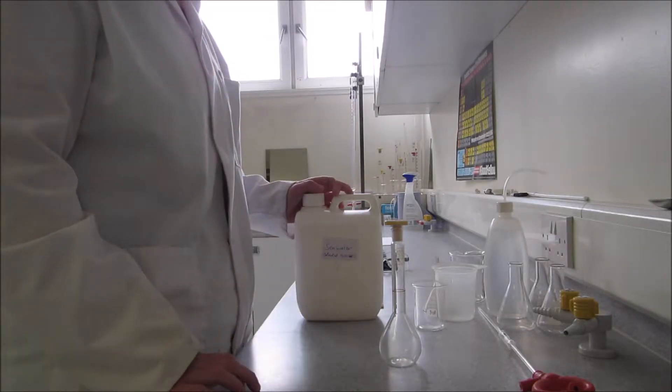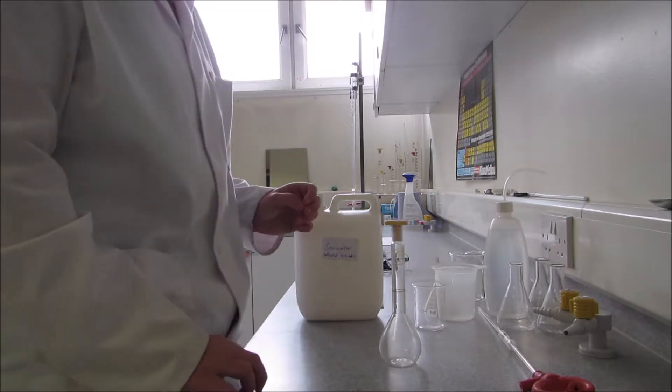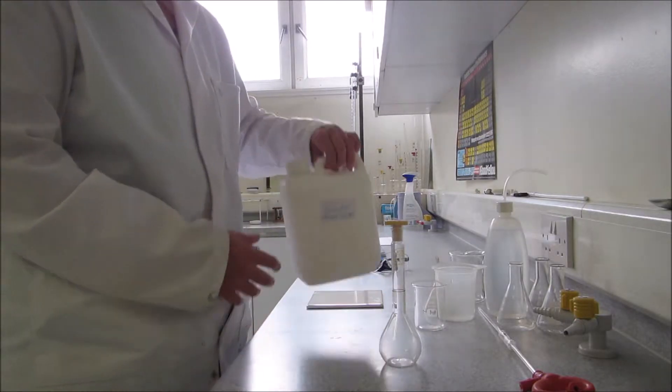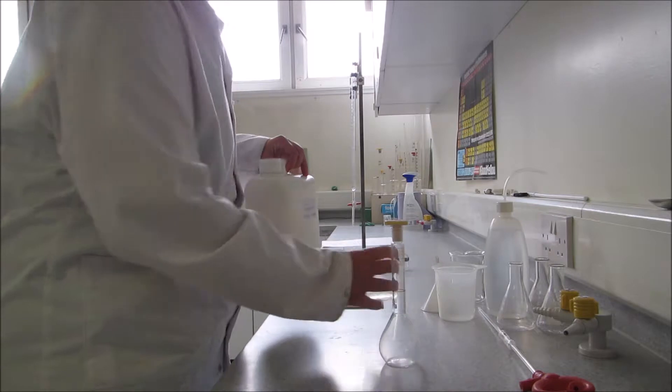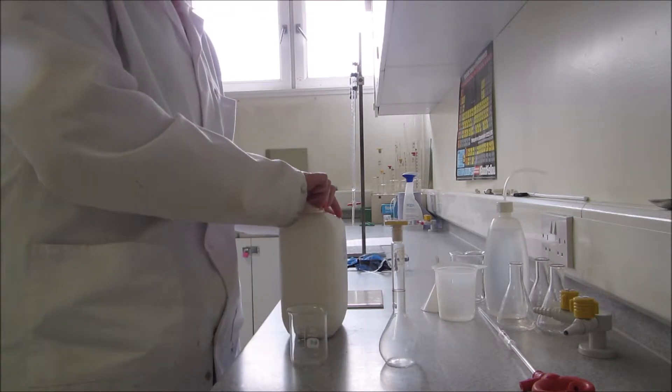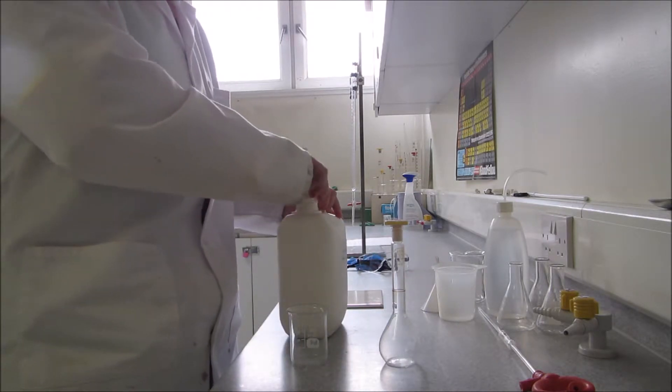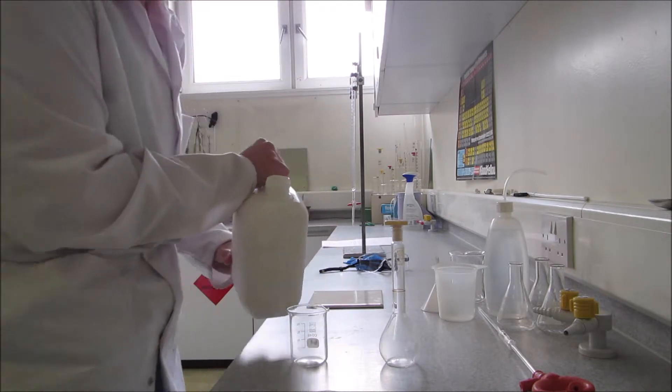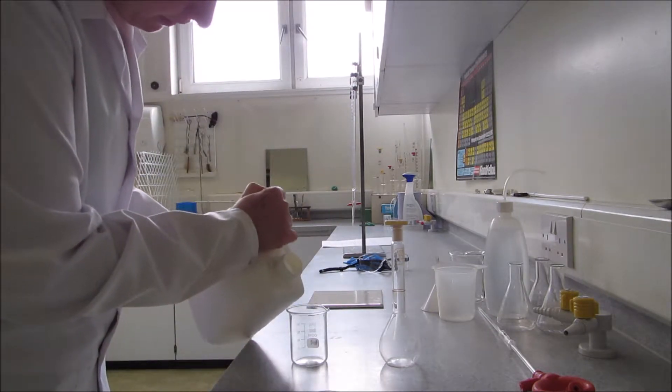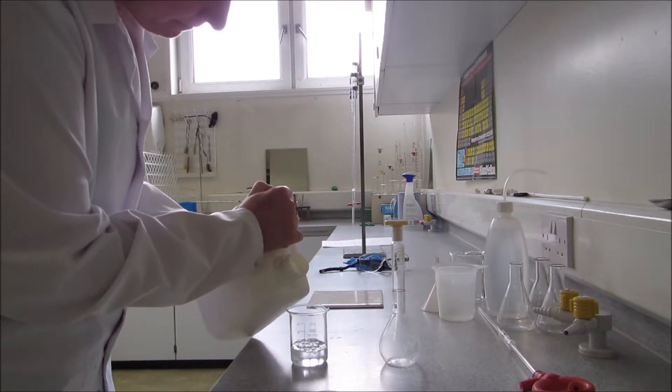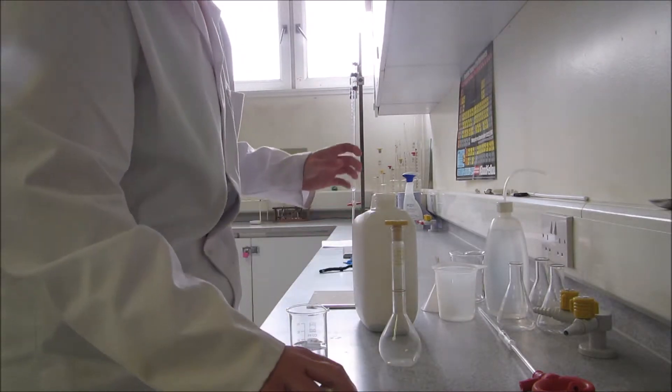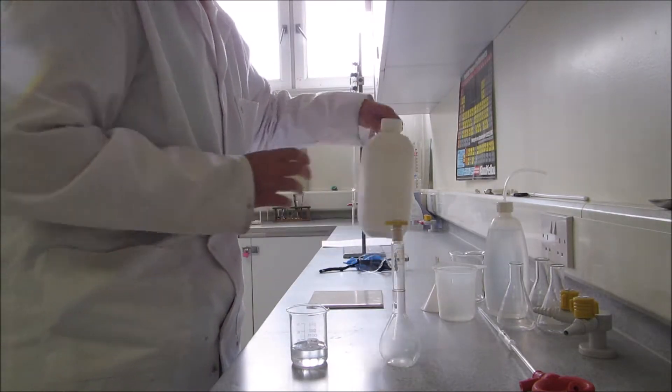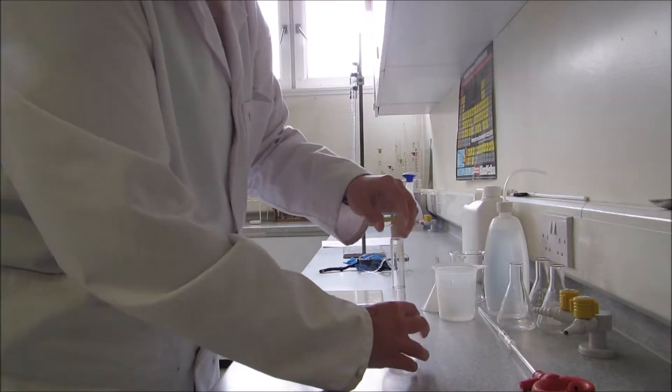This practical will show you how to estimate the chloride content of seawater. Firstly, a seawater sample was collected. This is a very high level of chloride ions, so I want to carry out a dilution. I'll just put a bit of the seawater into a beaker and I'm going to do a 1 in 10 dilution.